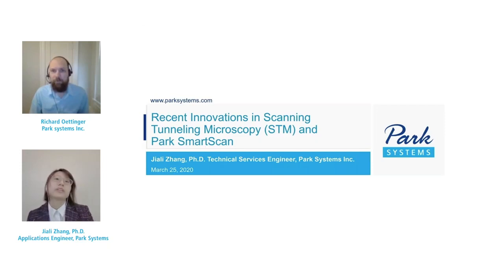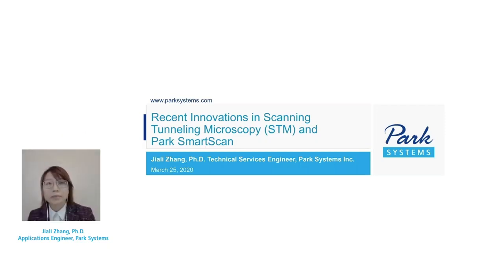Hello, everyone. Good morning, good afternoon, and good evening, depending on where you are. My name is Jiali, and I'm the Technical Services Engineer here at Park Systems. It is my great pleasure to give you this short webinar about Scanning Tunneling Microscopy, or STM, and the recent innovation of Park Systems software, SmartScan.